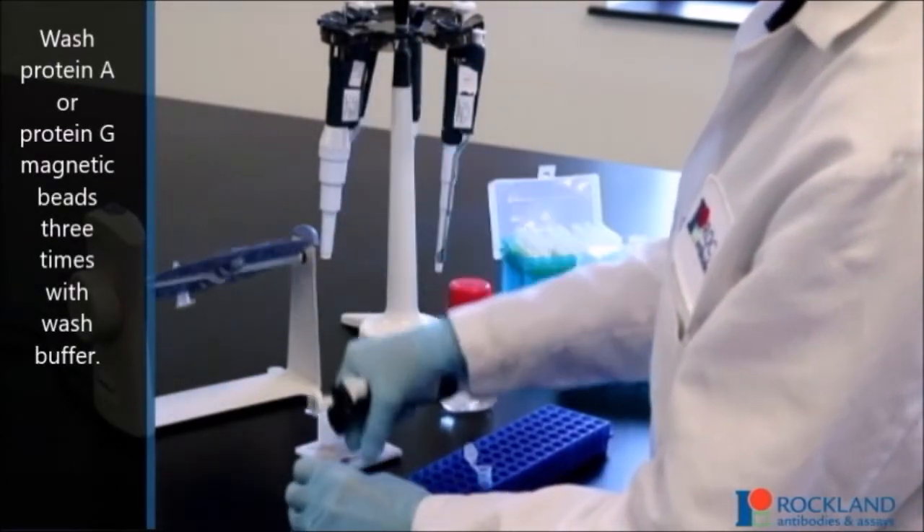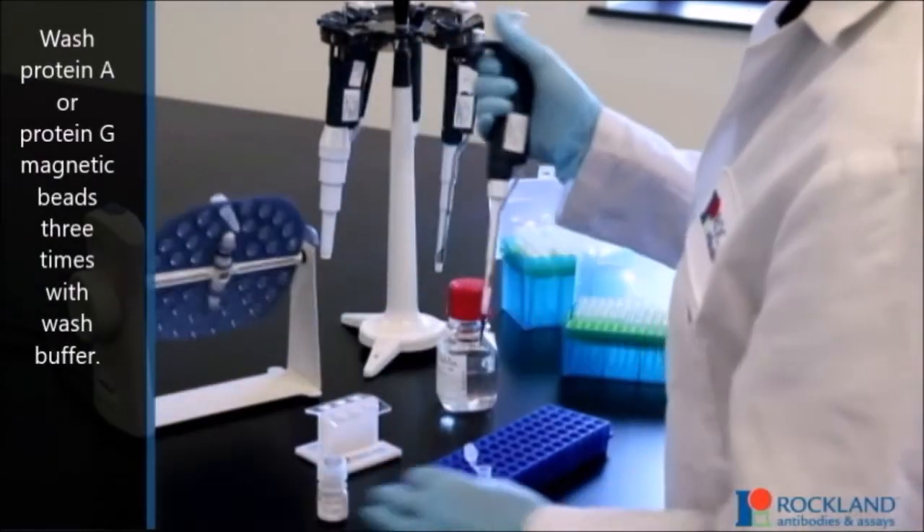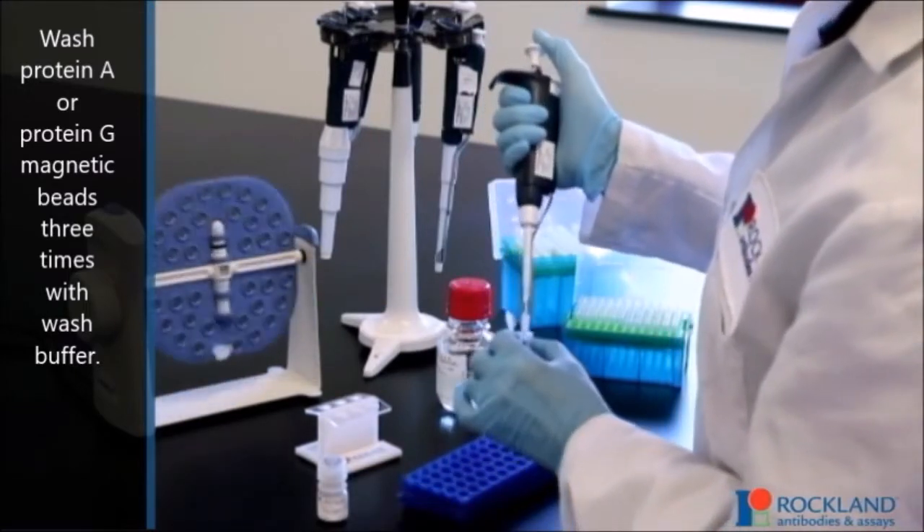Wash protein A or protein G magnetic beads three times with wash buffer.